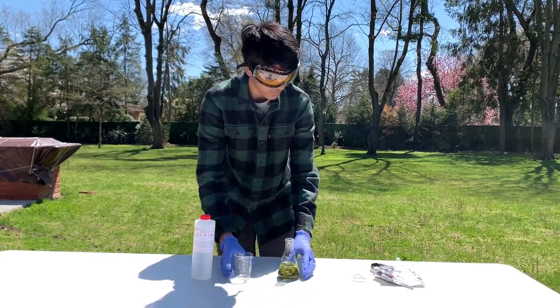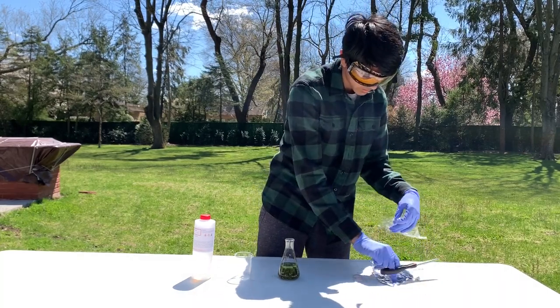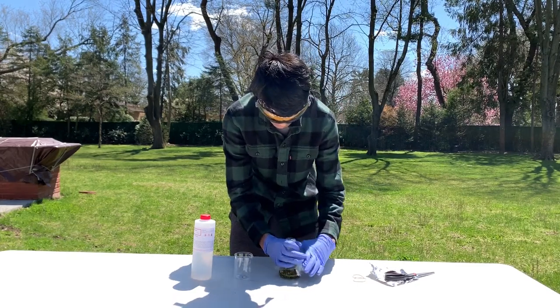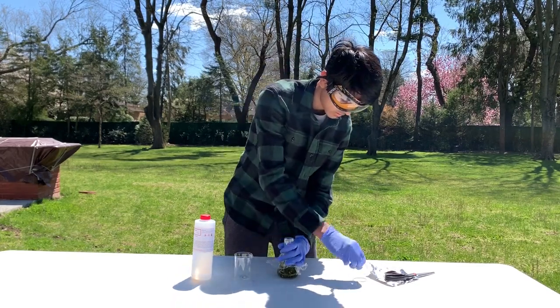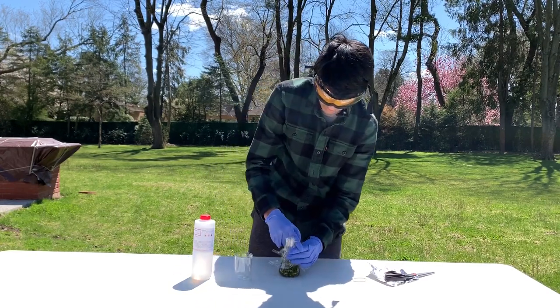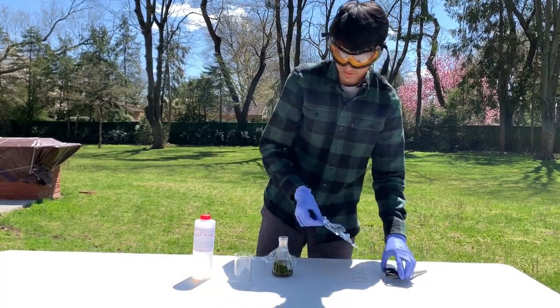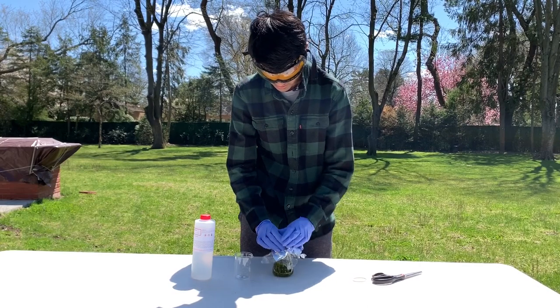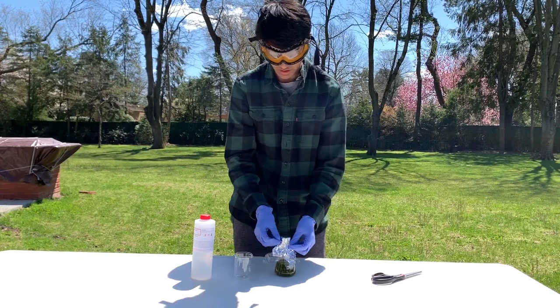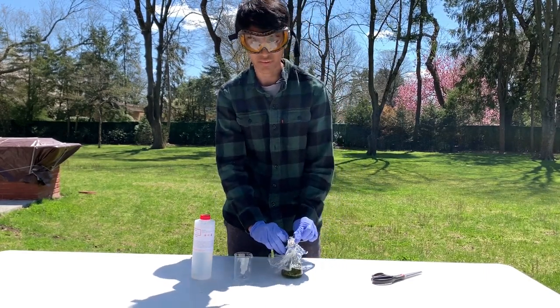And then we're going to immediately seal it because we don't want any of the methanol evaporating. I'm using a plastic wrap and then aluminum foil as a second layer. And then we're going to let this sit for around three to seven days to let all the capsaicin dissolve into the solution, and we're going to be mixing it once a day.